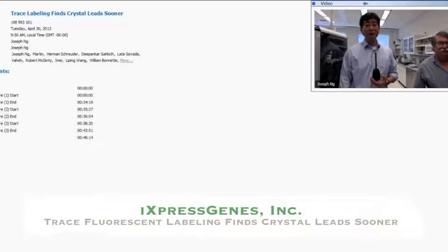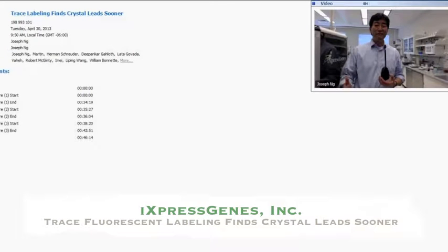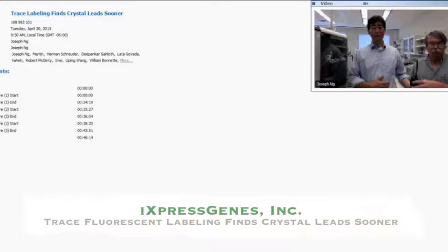Okay, we do have another one. Does this work with membrane proteins? And yes, we've talked about complexes, and this worked in the presence of detergents as well. It works for optimization procedures. We're undergoing a study using LCP at the moment, and Mark is looking at a number of membrane proteins for that. The difference with using membrane proteins is that the labeling procedure needs to be modified to get rid of the free probe, to make sure that you don't have probe lurking in your vesicles or your micelles.